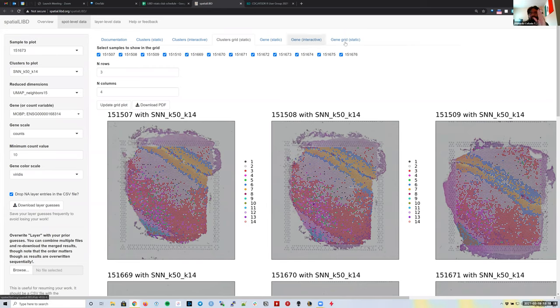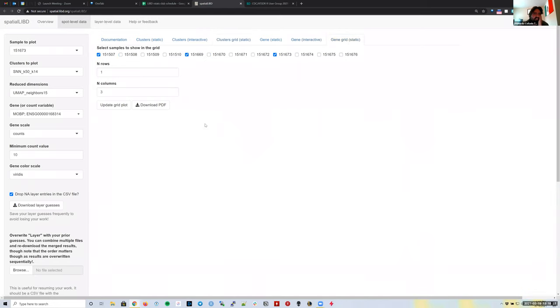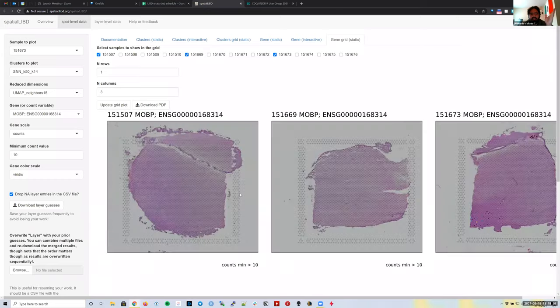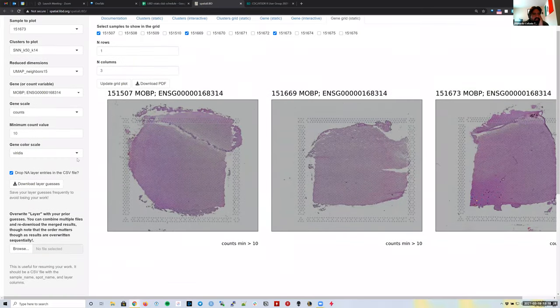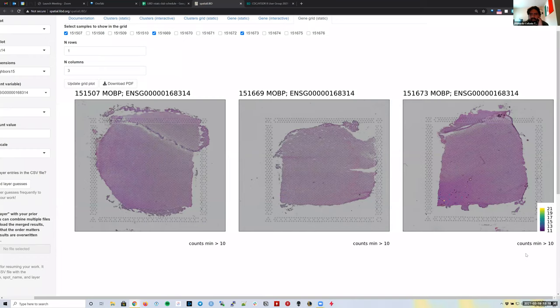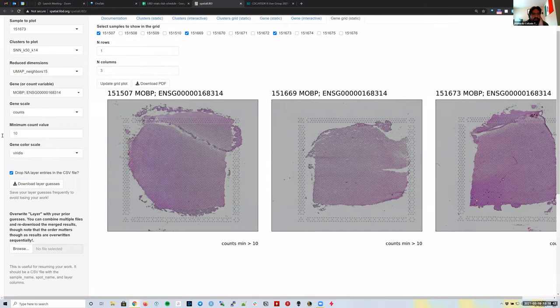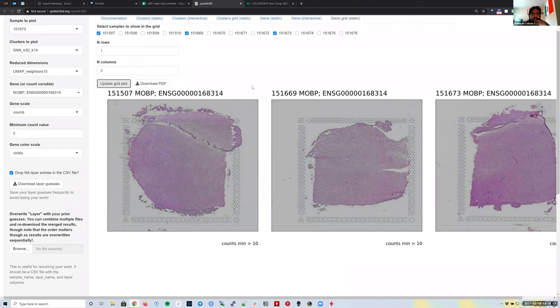Similarly, the Gene Grid Static tab lets you make grid plots for visualizing the expression of a particular gene across samples. I had a minimum threshold of 10 counts set too high — for example, the first two samples don't have 10 counts of MOBP — so I'll reduce it to 5. Just like the regular static tabs, you can download the grid as a PDF.